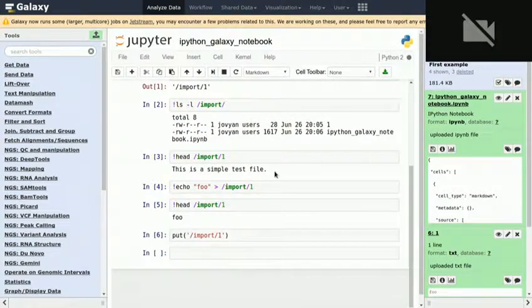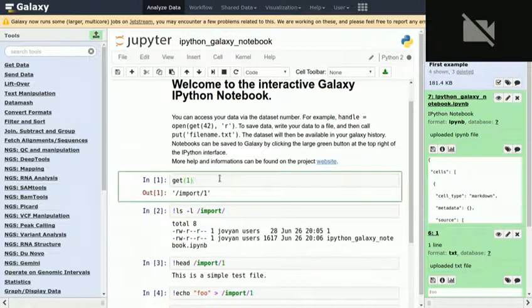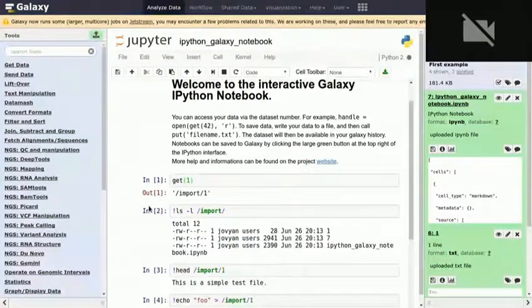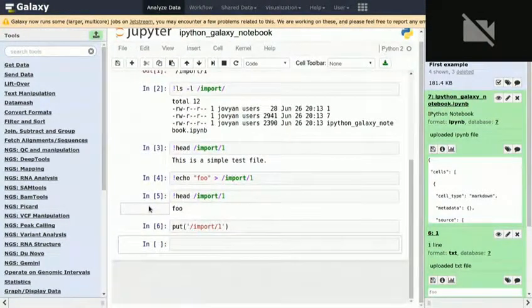And now you can just repeat or replay your notebook. This very much reminds me of a video player, and you can just play this notebook. So I can do this. Okay? You see everything is running. The star indicates that it's running, and you see, whoa, processing. It's copying again. So you have here the put command.